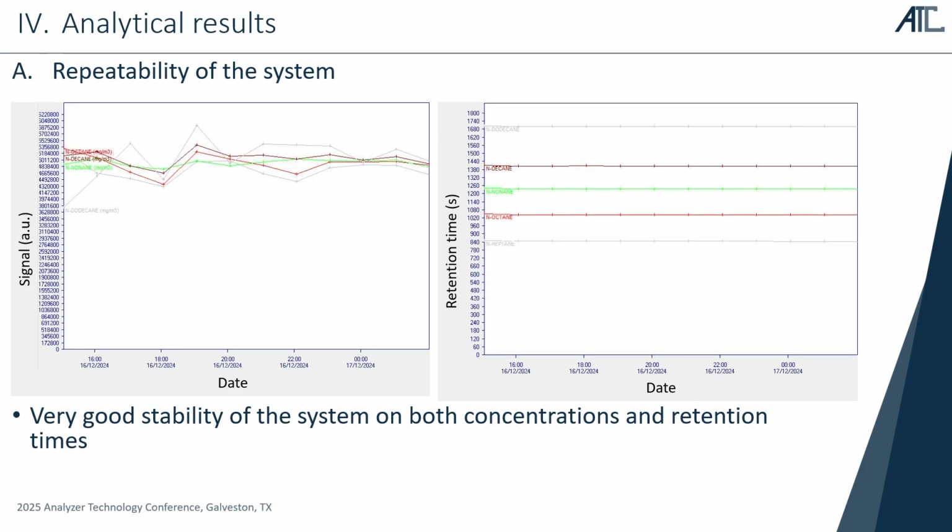Because even if you have GC and MS, there are so many compounds. If we want to be sure, the retention time stability is quite important because, for example, the alkane fragmentation patterns by GC-MS are more or less the same between each one. So if we have too much drift, that can make it more difficult to know which alkane we are looking at.